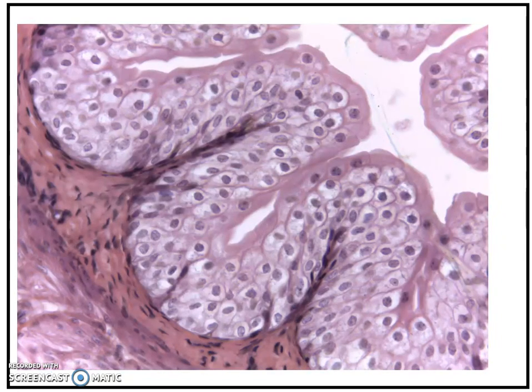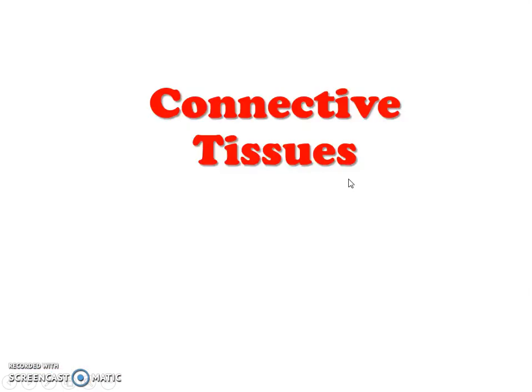And here's a slightly different picture of transitional epithelium. In this case, these deeper cells aren't necessarily going to be flatter. They're going to tend to be more rounded, like the ones that are superficial, close to the lumen. So transitional epithelium here. And this ends our discussion on epithelial tissues.